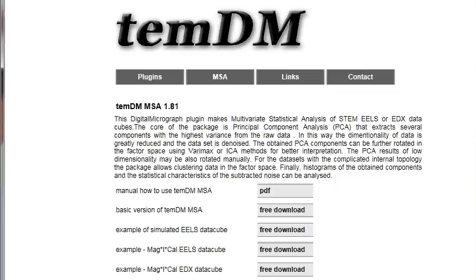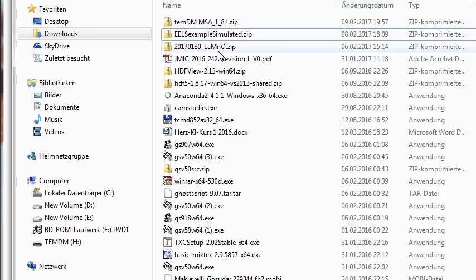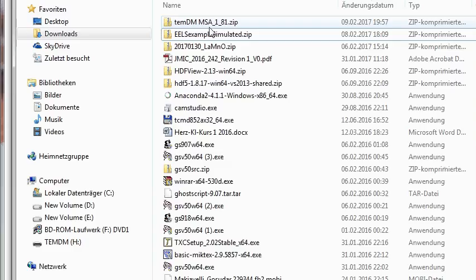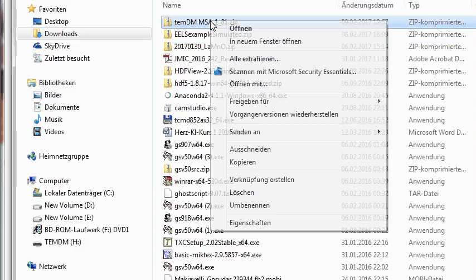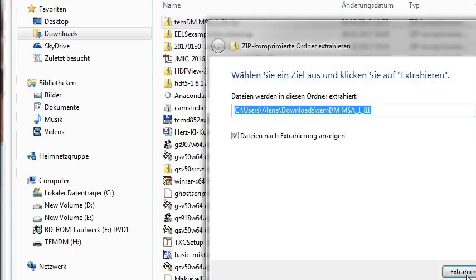Okay, I guess our download is finished. We go to the download folder. And here is our download. It's zipped, so we have to first unzip it. Extract all.